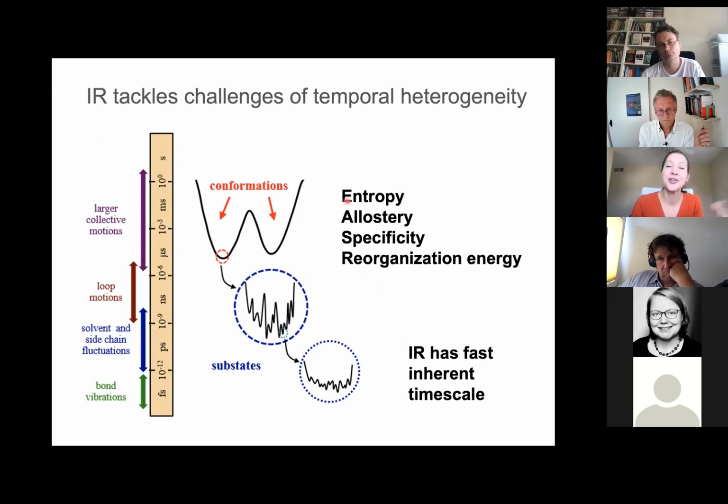Well, if you're Josh Wand and Andrew Liu, who do NMR order parameters, you'd argue that in fact, the major contribution of entropy changes in protein molecular recognition involves just these rapid side chain motions. So if you want to understand the molecular mechanisms of thermodynamics, it could be important. Also allostery: in a lot of proteins, you have domains and you might have a ligand bind one part of a protein and it's transmitted through very small local changes throughout that protein to impact a function on the other side of it. Again, small scale changes that could affect function.